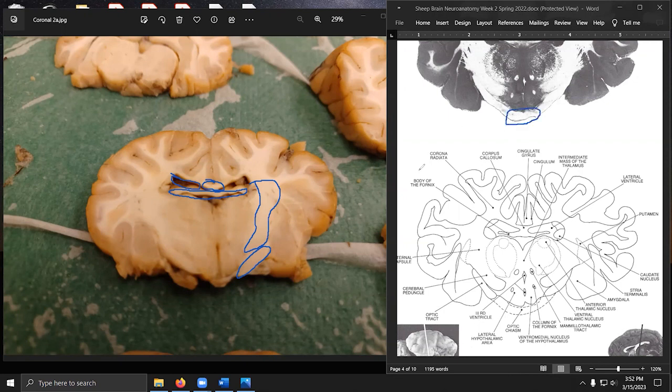So just to remind you, when we're going from the outside of the brain and then inward and posterior, we're starting with optic nerves coming out of the eyes. They meet and do the crossover at the optic chiasm, and then they split back up and then go far into the brain as optic tracts, which we'll see in successive images as we go along.